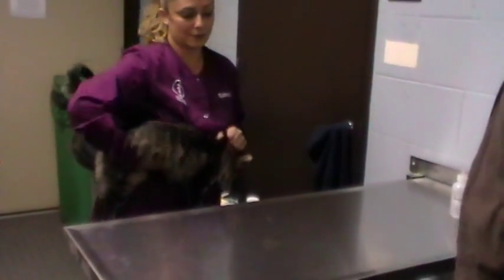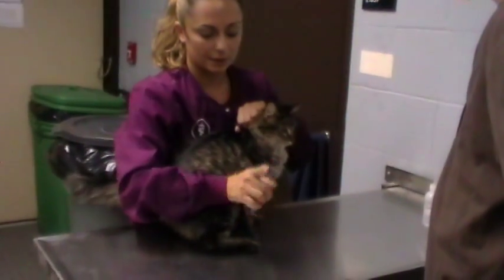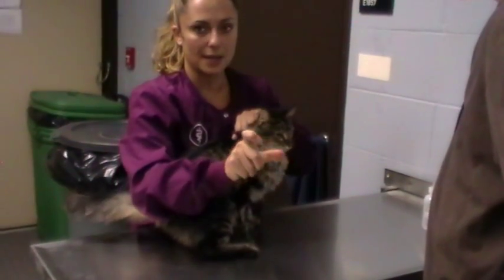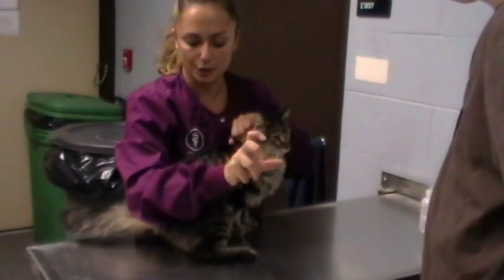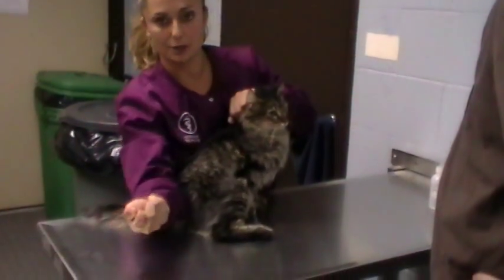We'll start with a lateral with Emma. I'm going to put her on the table, and whichever lateral I'm going to put her in is the hand I need to scruff. So I'm going to put her in right lateral — I'll scruff with my right hand and put her on her right side.